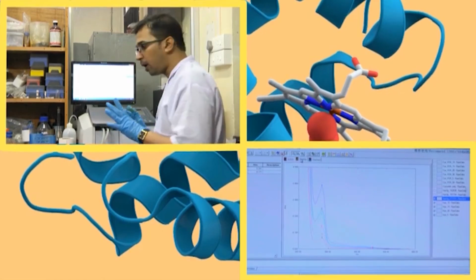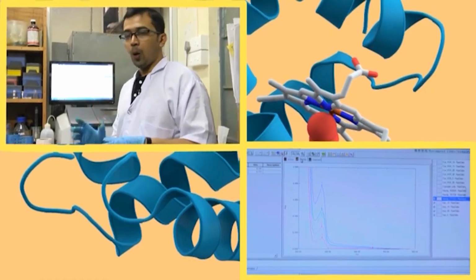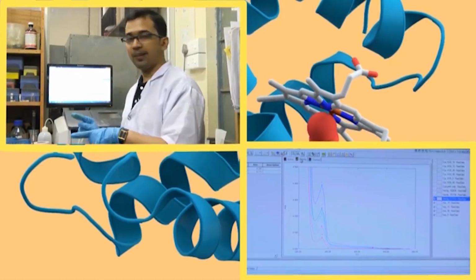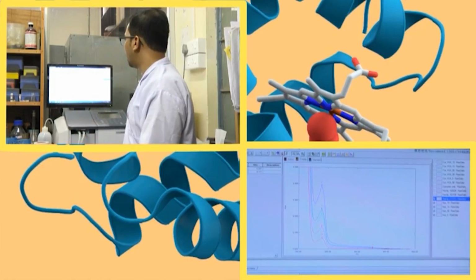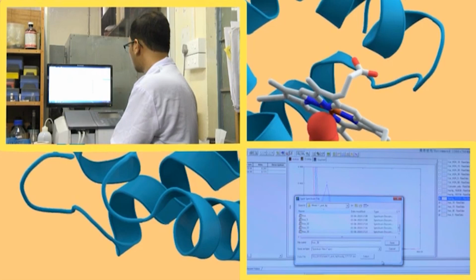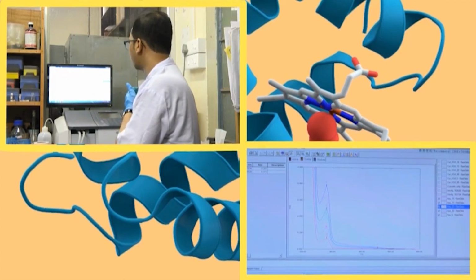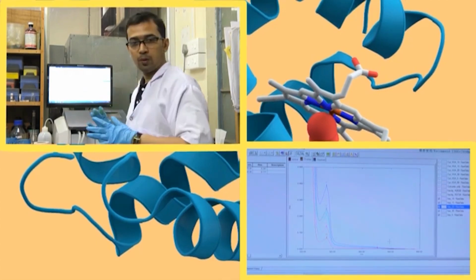So, what is the fundamental part here? If you forgot to save any spectrum while taking measurements, after the experiment you go to that spectrum, double click on it, go to the active tab bar and see whether that colored spectrum is active or not, and then go to File and, in a similar way, save it as 20. Let us see if I have saved it or not. I am now saving it as a text file, as 20.